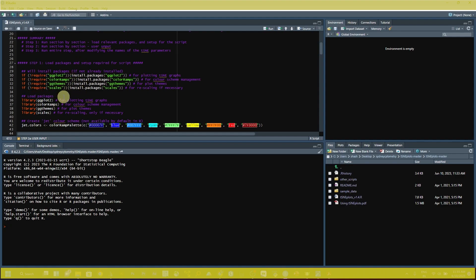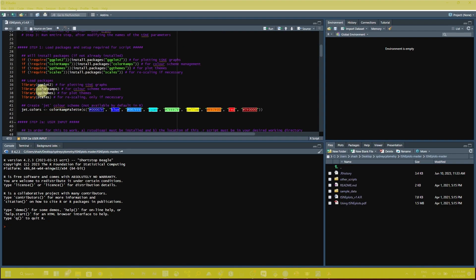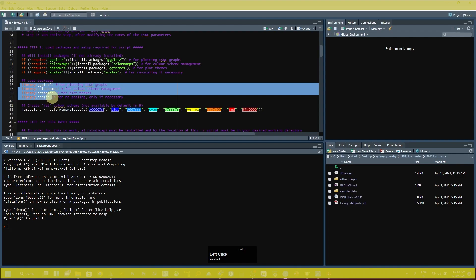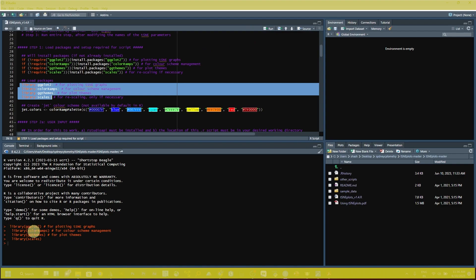From step one, you need packages like ggplot2 and colorRamp to run this script. I have already installed all the packages, but if you don't have them, you have to install them using the provided commands. After installing, you have to load these packages in your console. Select all the library commands and click Run — you can see all the packages are now loaded in the console window.